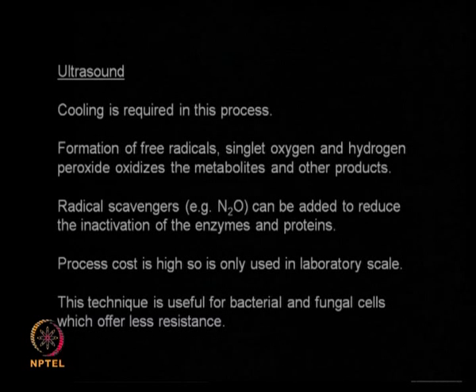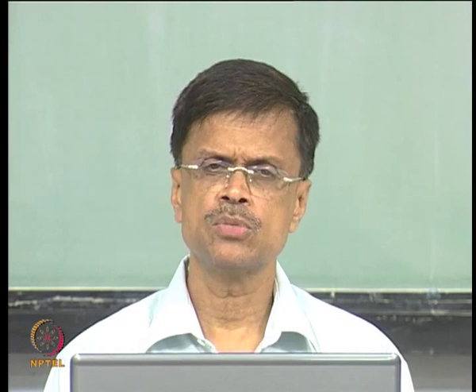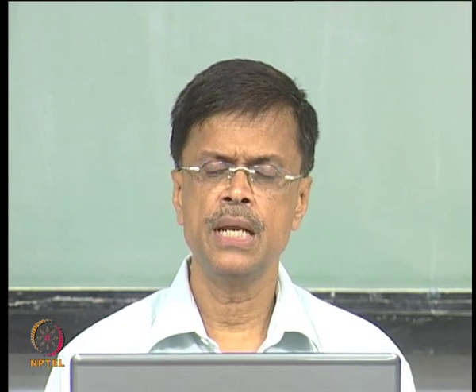The process cost is high in ultrasound treatment, so generally it is used in laboratory scale applications and not in full scale industrial production. In small scale applications, if you are performing a fermentation and are interested in recovering some intracellular products, ultrasound is a very good treatment.